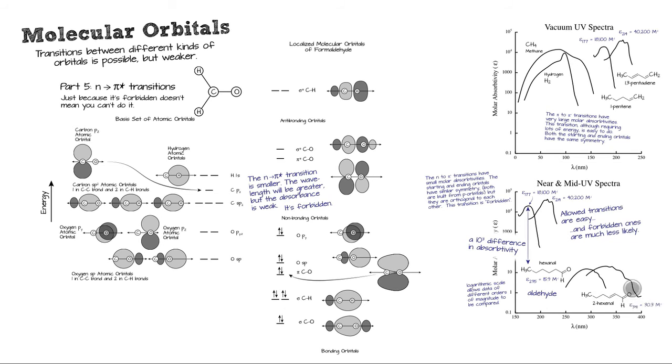And if we conjugate, look over here on the right, we're going to, again, spread the electrons out and move that up. So if we look at the change in UV spectra, we can see changes in conjugation. We can estimate the conjugation by the frequency. There's tables of data that you can use to calculate what the frequency would be with a simple carbonyl, and then how it would change as you add double bonds or other groups. So you can come up with an estimate for the level of conjugation from UV spectroscopy. So it's somewhat useful for that.